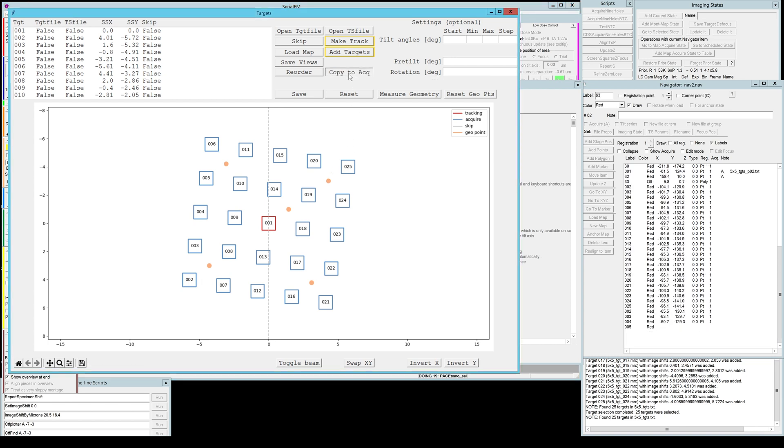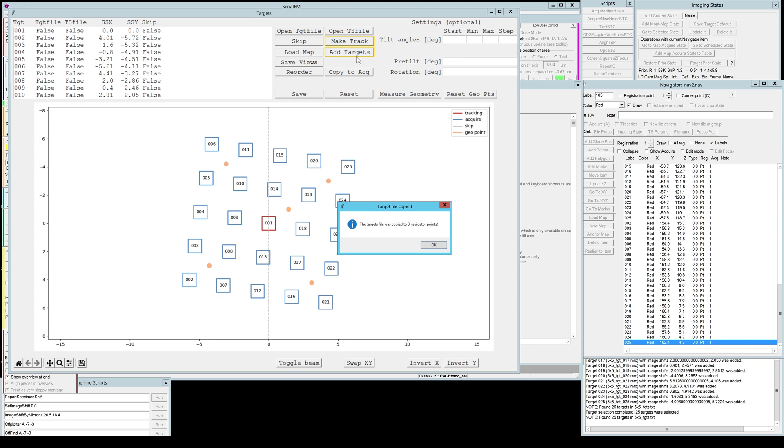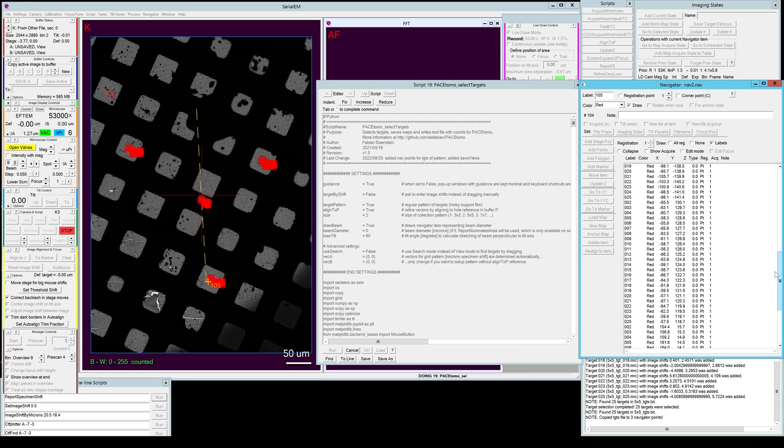This will make a few things. It will go through all of your points, it will make physical copies of the target file and give them a slightly different name so you won't run into problems of having tilt series with the same name at different target points. It will actually go through them, let's scroll up here, and call them position one, position two and position three.